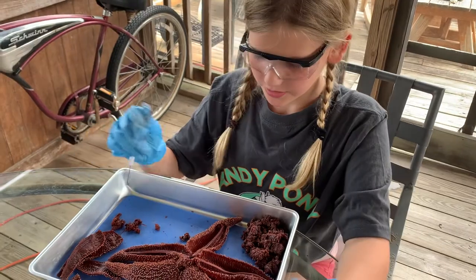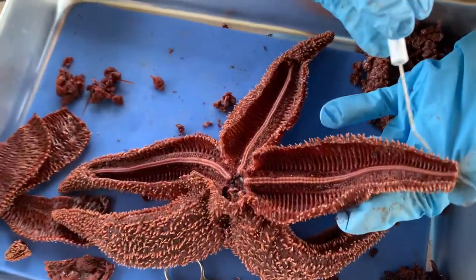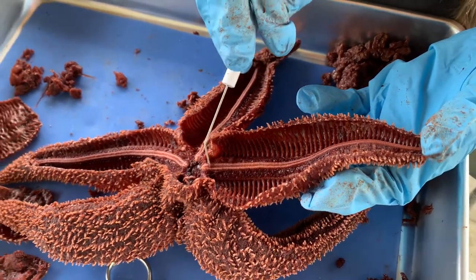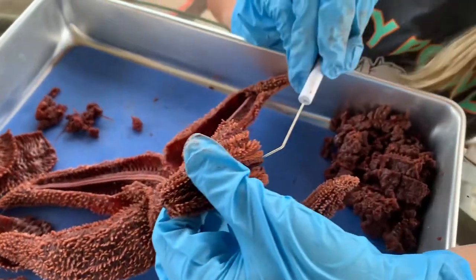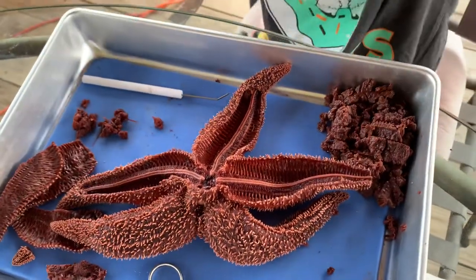The ambulacral ridge looks almost like a spine on each of the arms. And if you see, it lines up perfectly with the ambulacral groove, which is on the external part of the starfish's body.